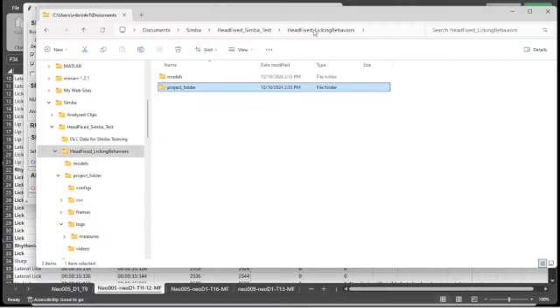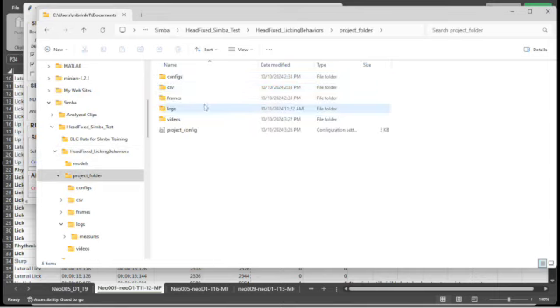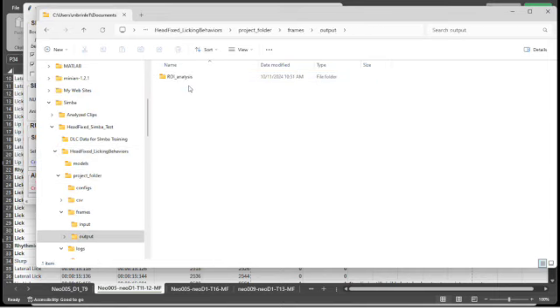So my video will be stored in my project folder and then frames output of each ROI region, the number of times spent in that region for the body part, the tip tongue, and the number of entries. And so now you can see the lip lick entries increased, the spout entries increased, and I have times for both of those.